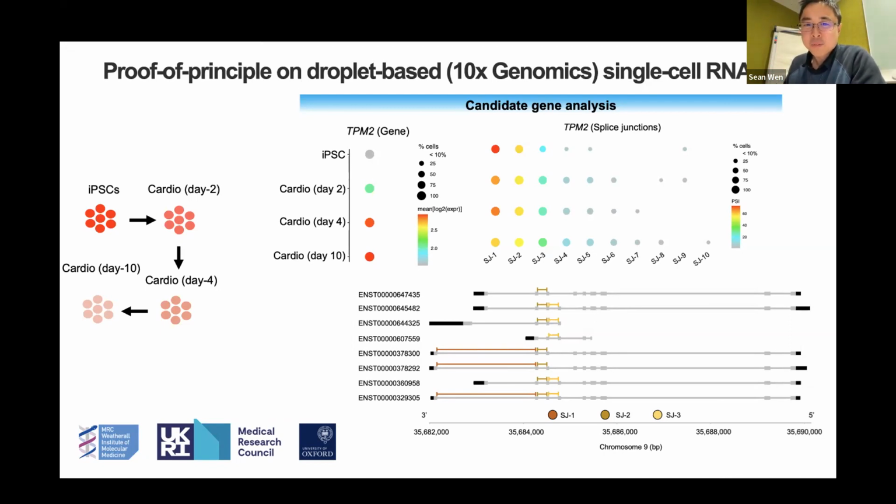And also, when the time comes to perform functional validation in the laboratory, your colleague is going to ask you which isoform is expressed, because they need to build the construct or design the single guide RNA to specific exons of the gene. And so that's when splicing analysis will be helpful, because it helps you answer the question, which isoforms are most relevant for your gene of interest.